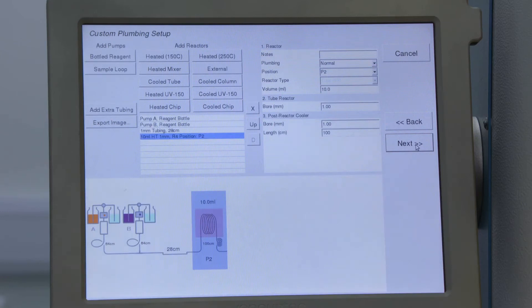I tell the system what configuration of reactors I'm using. So I told it that I have two pumps with bottled reagents and I told it what the concentration of those reagents are, what extra tubing I have, and what reactor I'm using. The rest of the tubing I've defined elsewhere.